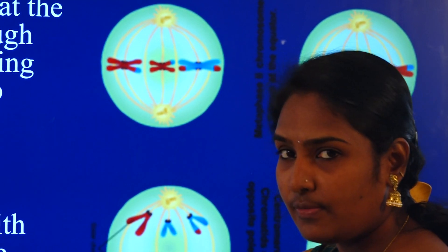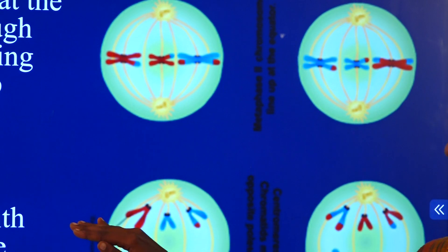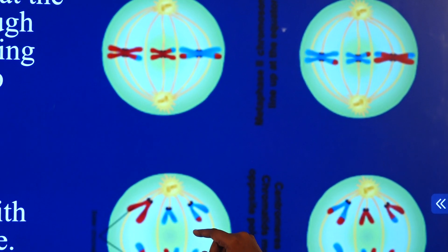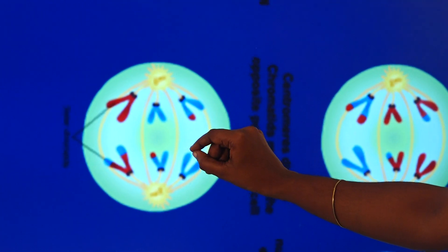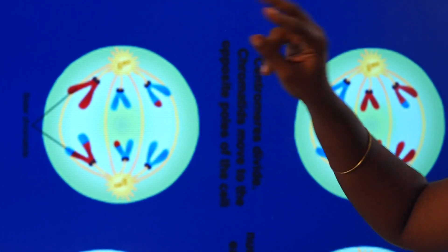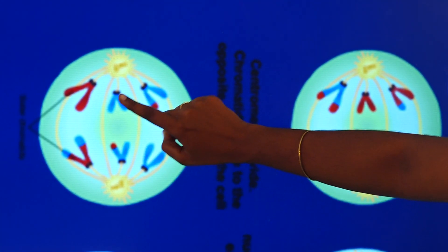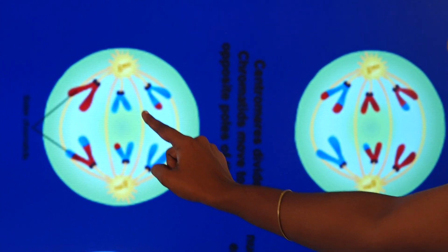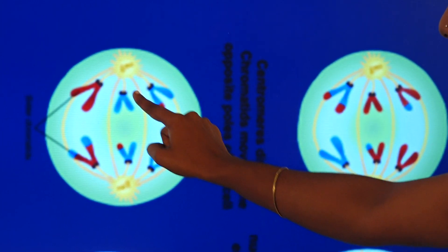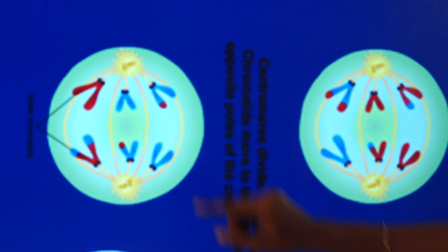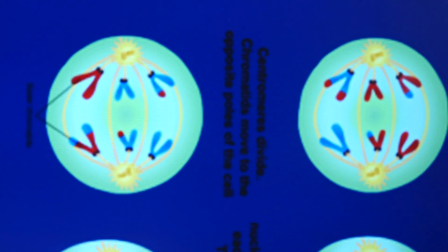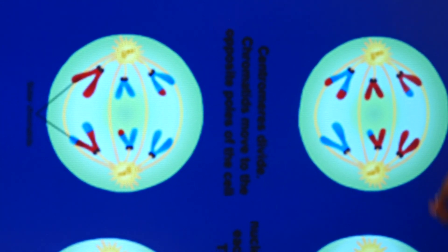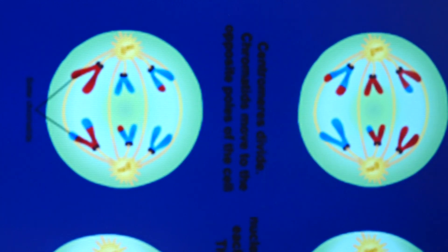The next is anaphase II. In anaphase II, the chromosomes will split. Unlike anaphase I where there were two chromatids together, in anaphase II there will be one chromatid per chromosome. Those single chromatids will move towards the opposite poles.